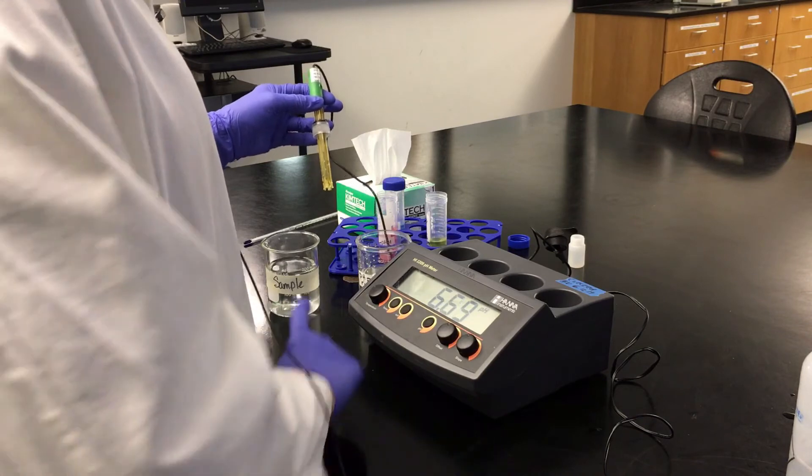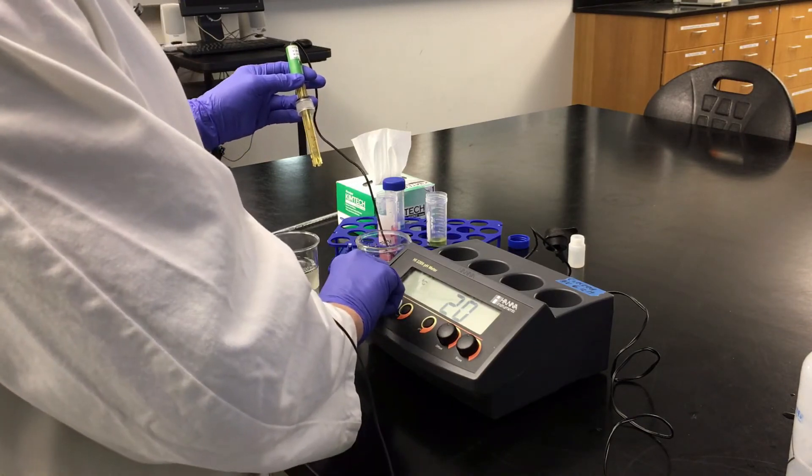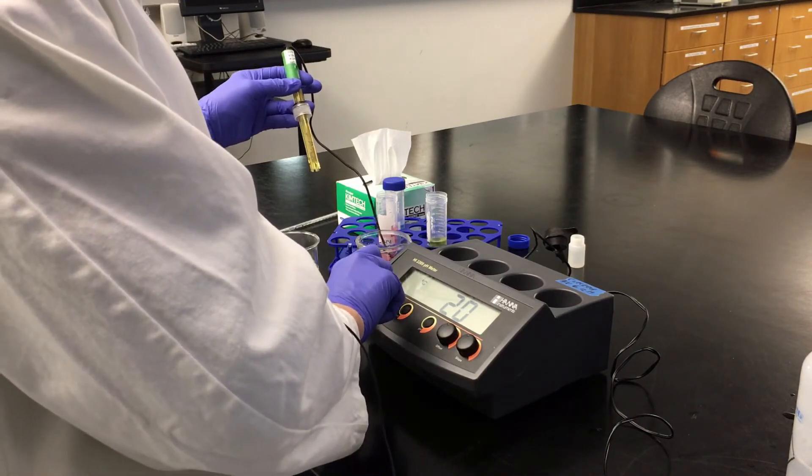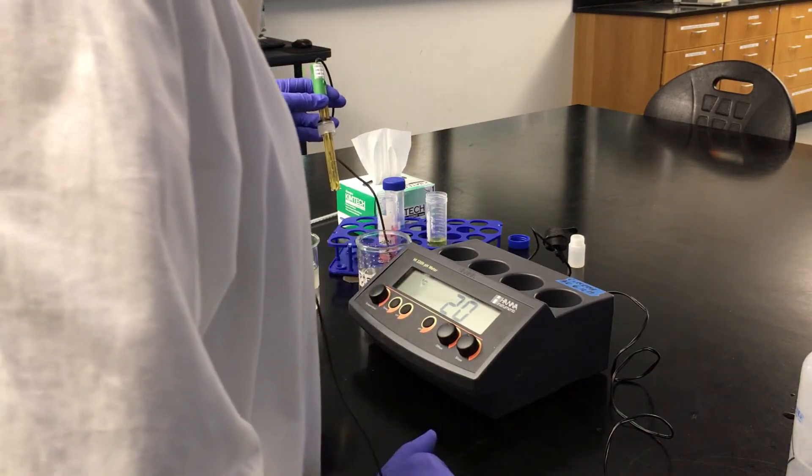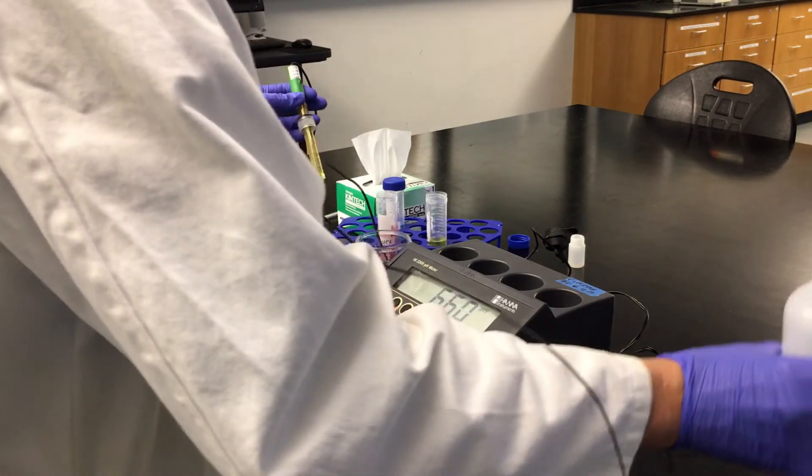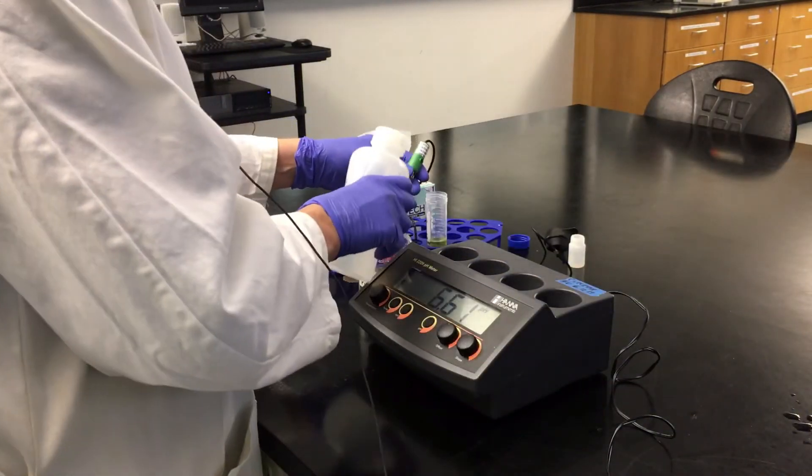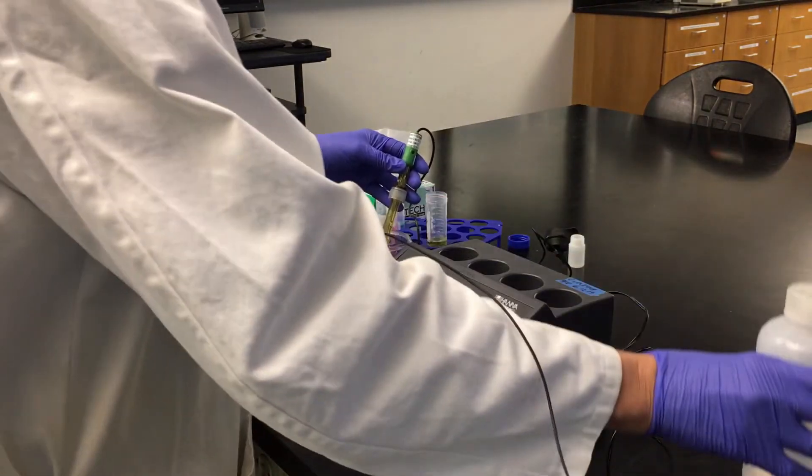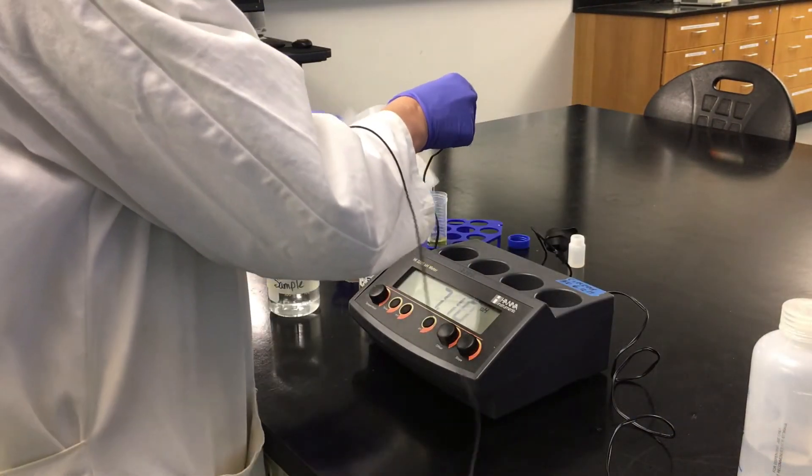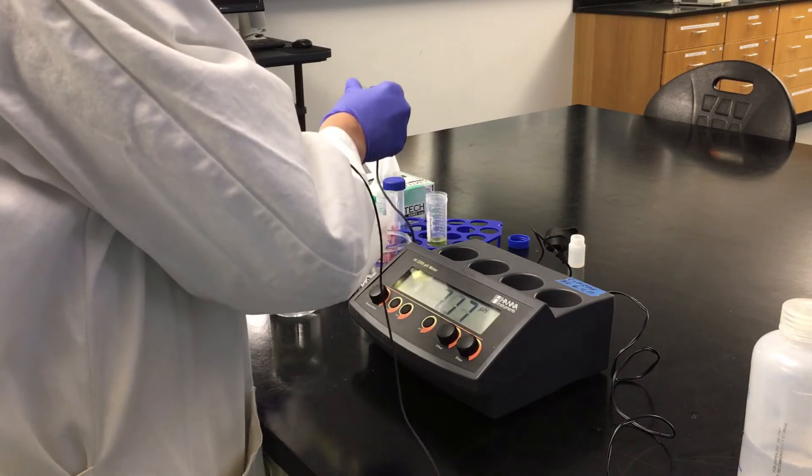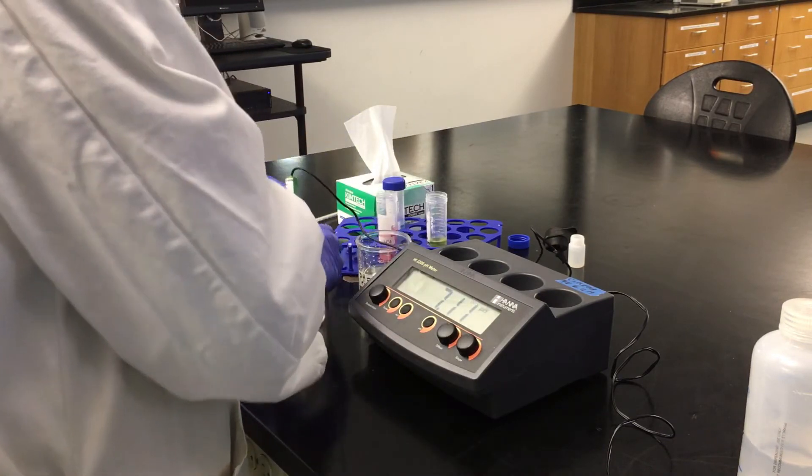If that was not the temperature, you would press and hold the temp button and adjust the temperature knob until you got to the right temperature, which it already reads 20 C. Then we are going to, again, place the probe into our sample and get a reading.